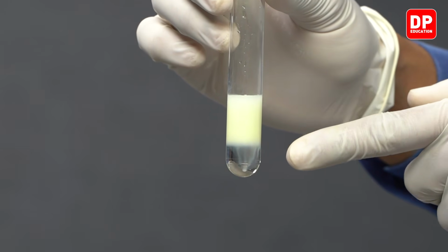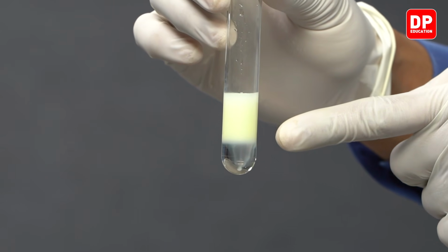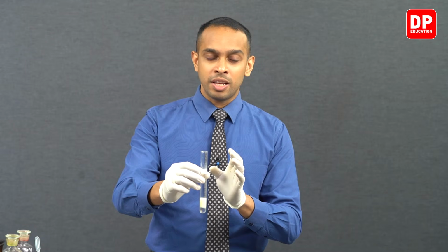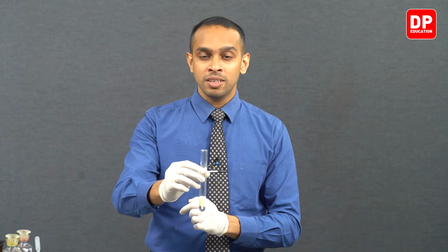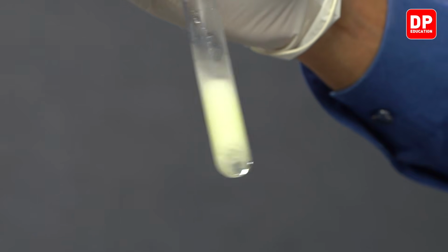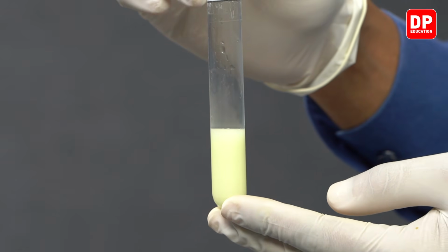So sulfur solid is produced here, and you can see it has a bit of a yellowish color, and this observation proves that in the solution that we initially took to our test tube, there were thiosulfate ions.